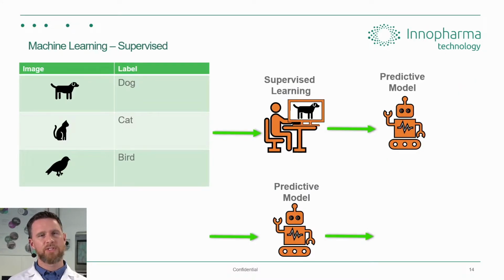So a little bit about machine learning. Here we have a generic model of how a vision system could be used. If we take images of, let's say, cats or dogs and birds, and we label them that it's a cat and a dog, with supervised learning, we can then build a predictive model. And what that really means is the next time our machine learning system comes across a dog in the real world, for example, it can then return the variable that it's seen a dog.